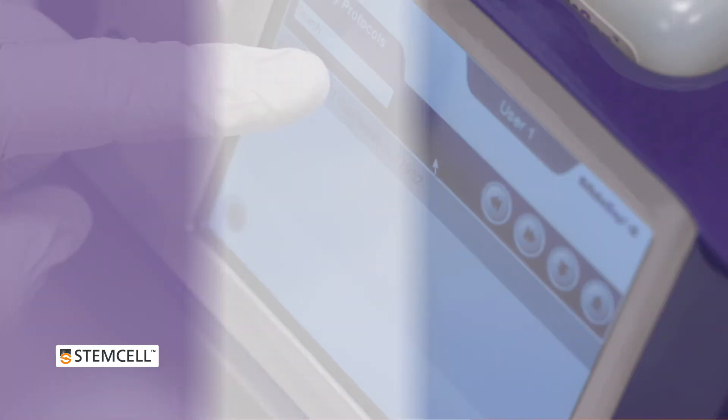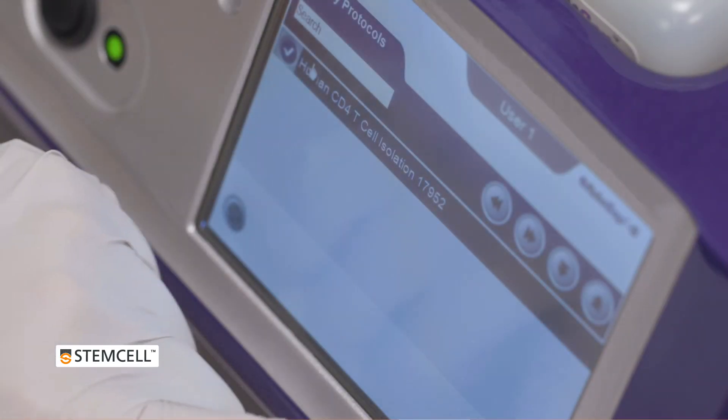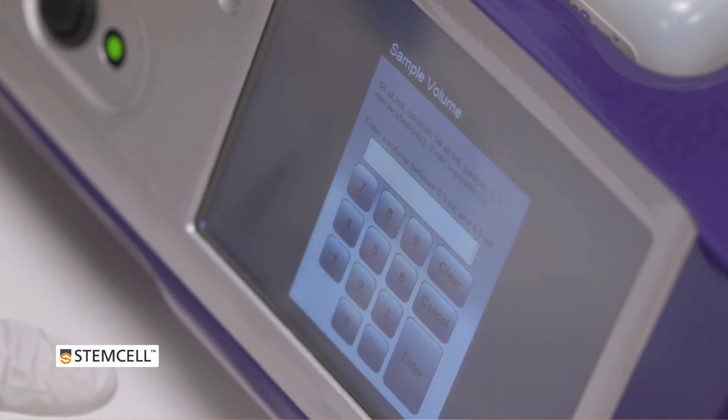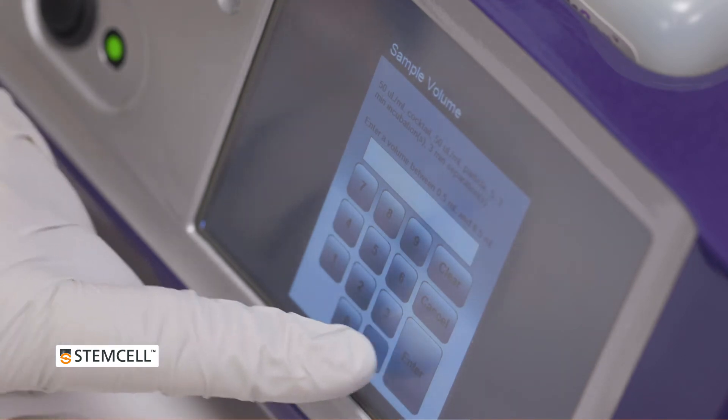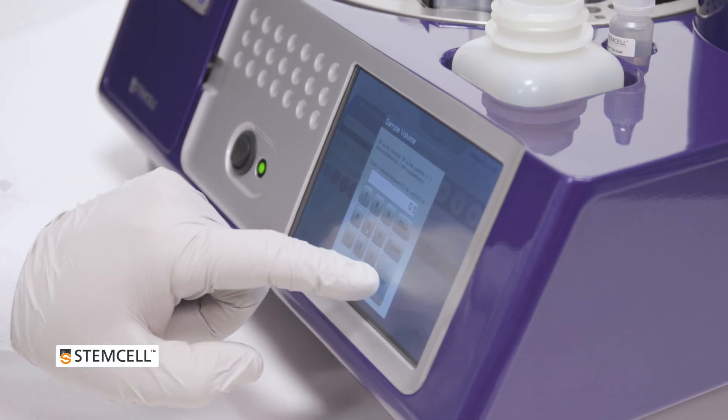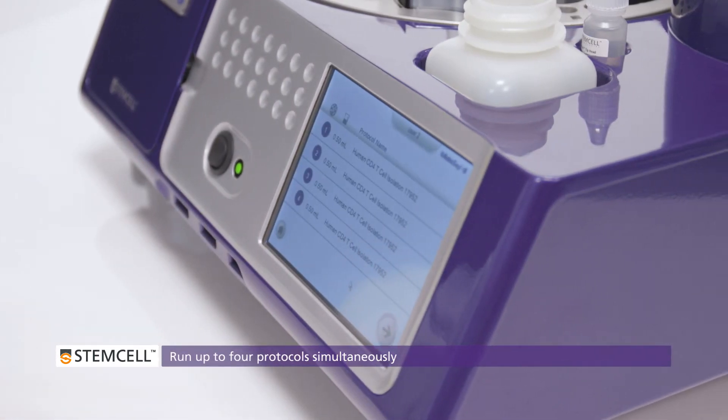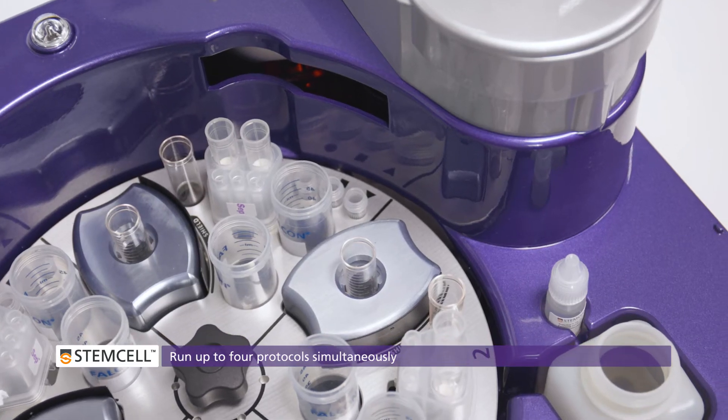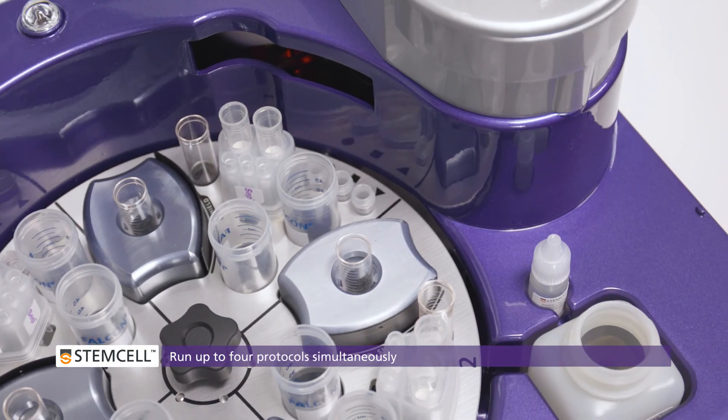Repeat these steps until all desired protocols are selected for each quadrant. Up to four protocols can be selected and run simultaneously.